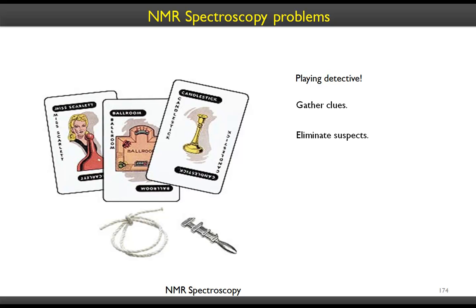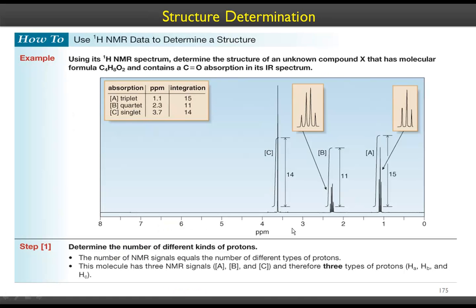We'll be talking about C13. We already talked about IR and mass and UV spectroscopy. So you take the help of all these spectroscopic tools and collect the clues from as much as you can, and then eliminate the suspects as you would in forensic science, right? You have to be careful though. You have to double check, cross check, confirm, and then assign the structure.